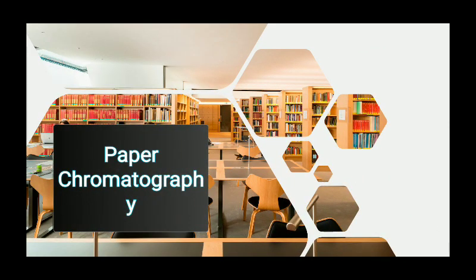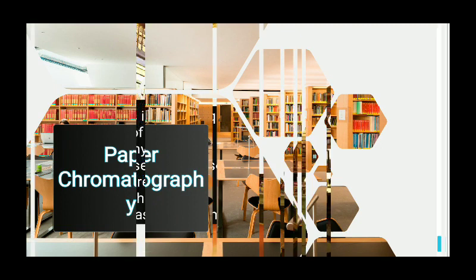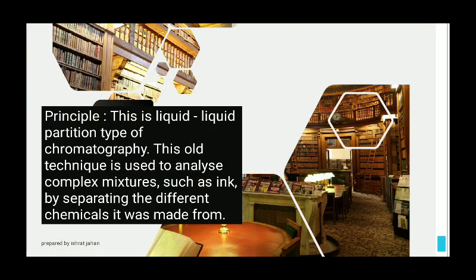Paper chromatography. Paper chromatography is a liquid partition type of chromatography. This old technique is used to analyze complex mixtures such as ink by separating the different chemicals it was made from.